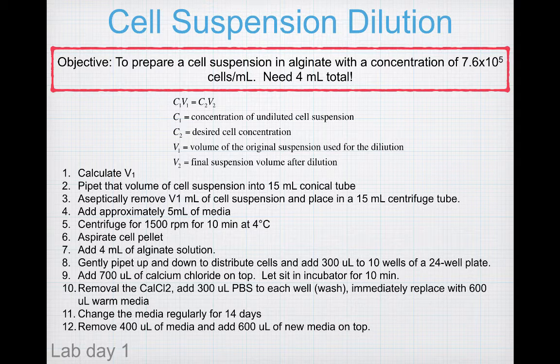And remember, you have to change the media regularly, at least every Monday, Wednesday, and Friday. And each time you change the media, remember that it has to be warmed to 37 degrees in the water bath before using it, and only open your media bottles in the laminar flow hoods to keep everything sterile. And when you change the media, you'll start by removing 400 microliters of the media that's already there, and then adding 600 microliters of the fresh media on top.